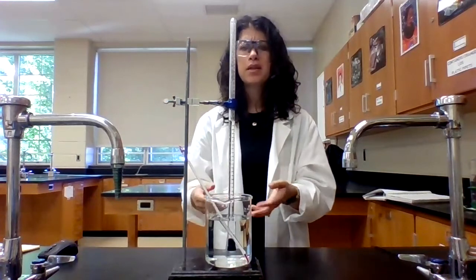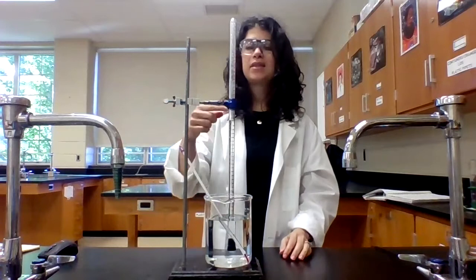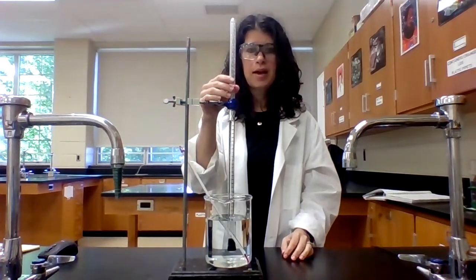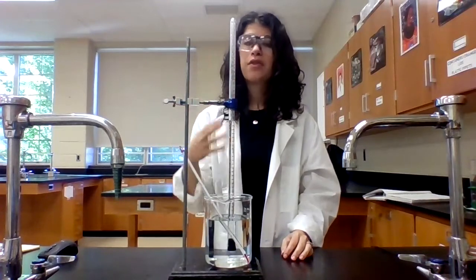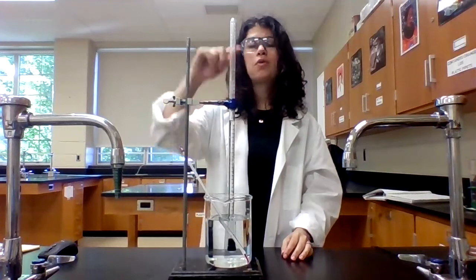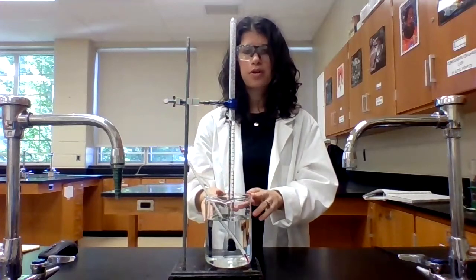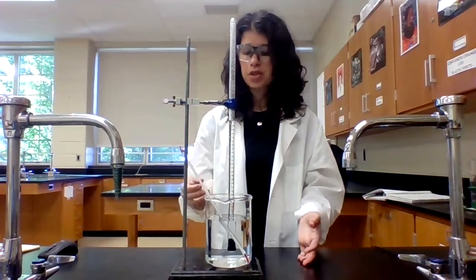And the reason why I need the temperature of the water is that there is water vapor mixed in with my hydrogen gas. And I'm going to need to use Dalton's law to subtract out the vapor pressure of the water so that I can determine what the pressure of just the gas is. So I need to know what the temperature of this water is, because the vapor pressure of water is going to change depending on the temperature.